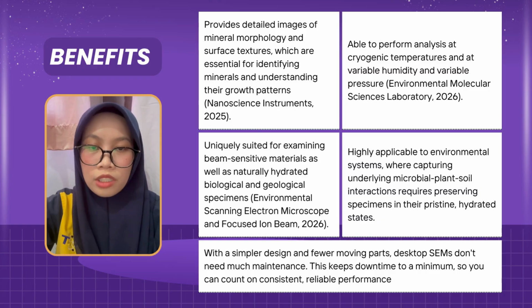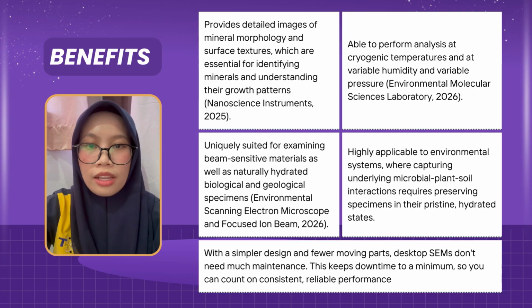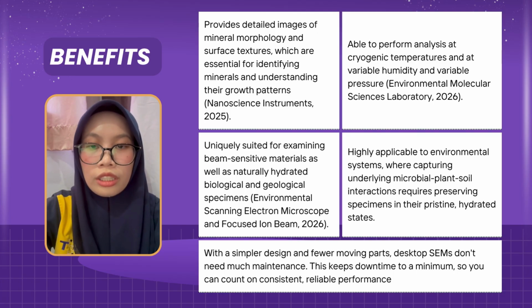So for benefits, first of all, it provides detailed images of mineral morphology and surface texture, which are essential for identifying minerals and understanding their growth patterns. Next, for the second one, it is able to perform analysis at cryogenic temperatures and at variable humidity and variable pressure.